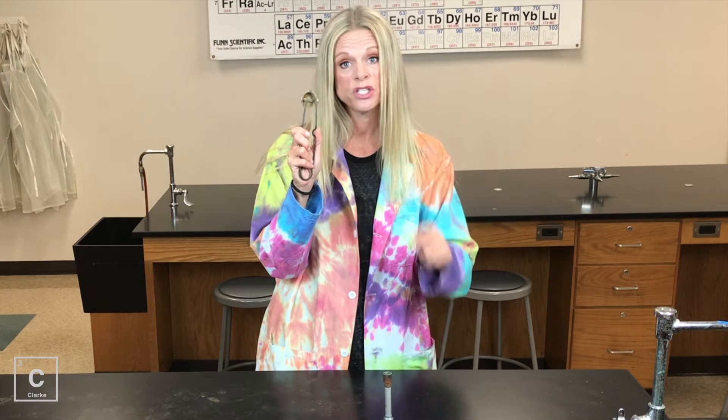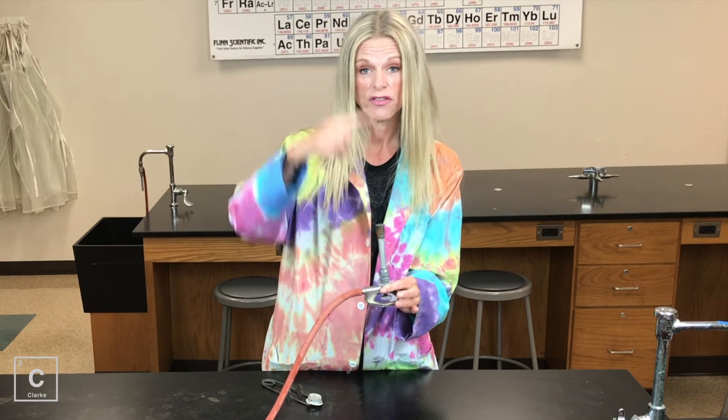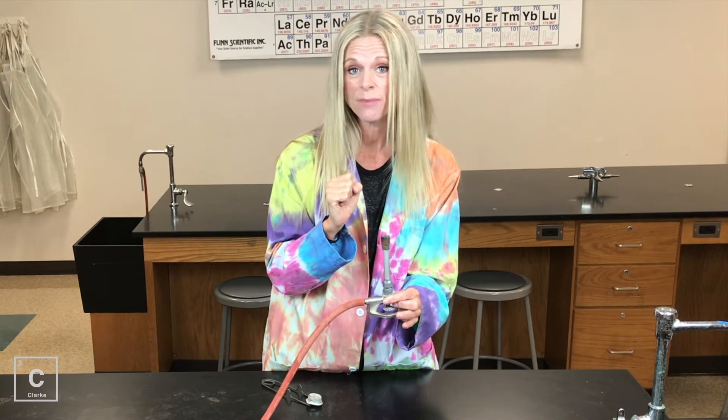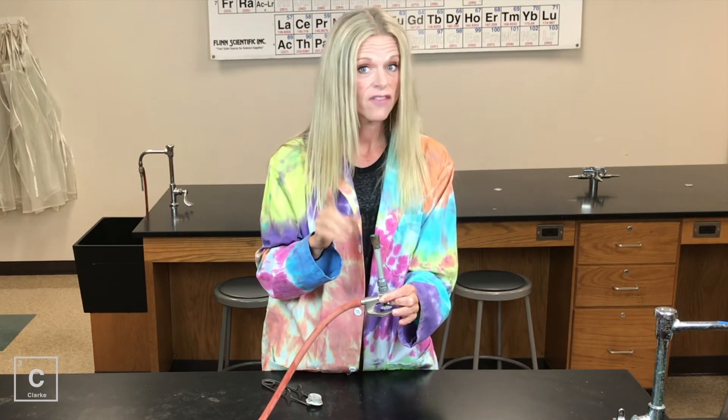A striker. I promise you can do it. I'm also going to teach you how to adjust all these different nozzles on the Bunsen burner so you can get the fire as big as you want it and you can make it as hot as you would like. You're still going to probably need some paper and something to write with because I'm going to ask you to make a couple of sketches. So go get that stuff and let's get started.